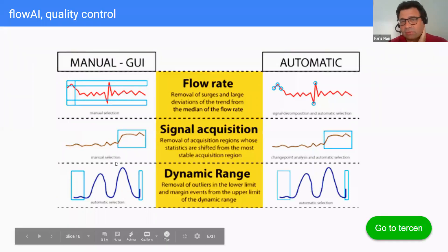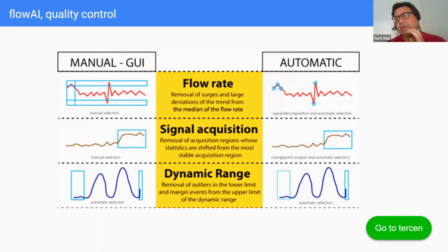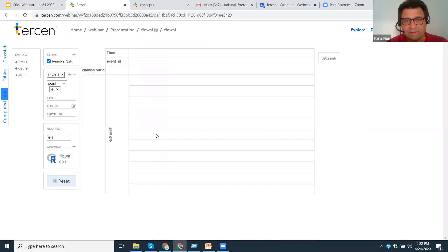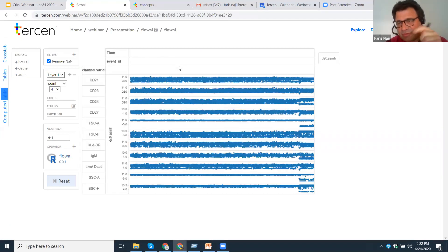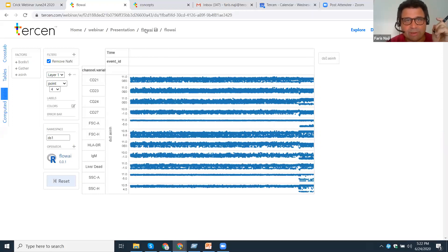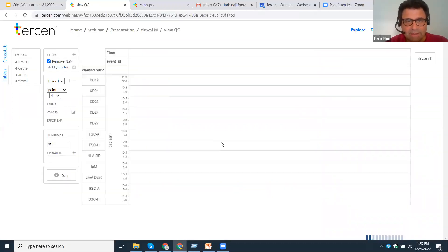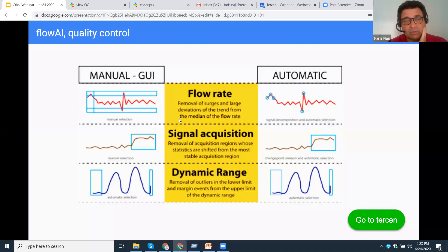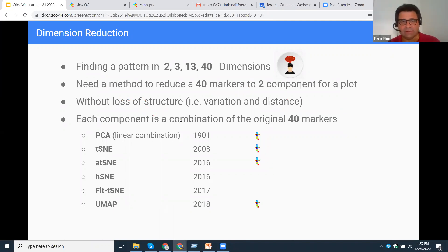Then there's FlowAI — a package that looks for surges in your data. It needs a time element in the projection. You can see here in Tersen it identifies a surge going on in the later time points. When you run FlowAI, it gives you a flag that you can use to kick out the surge at the end. I also have FlowClean. If you have a cleaning algorithm you'd like to add, please contact us. FlowAI and FlowClean are what are used for quality control.